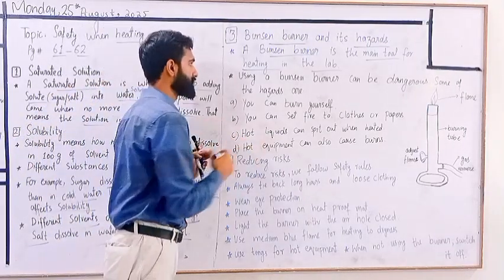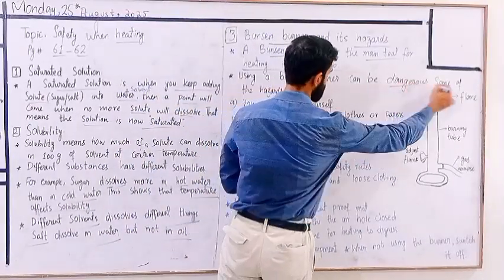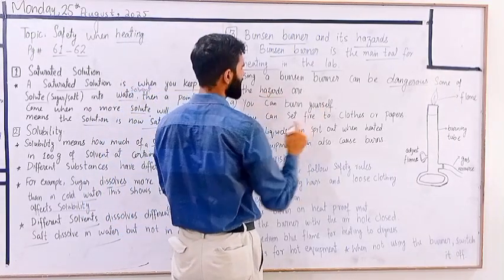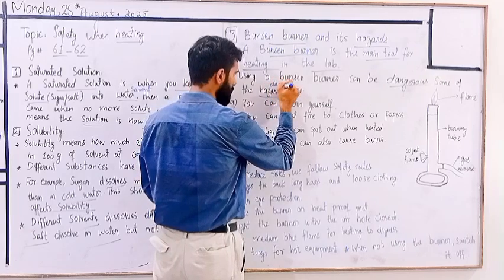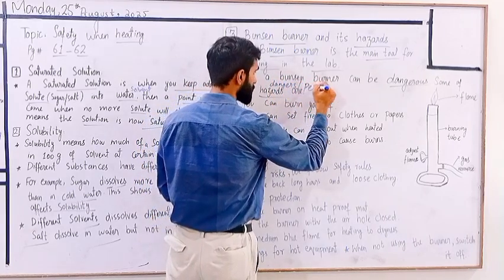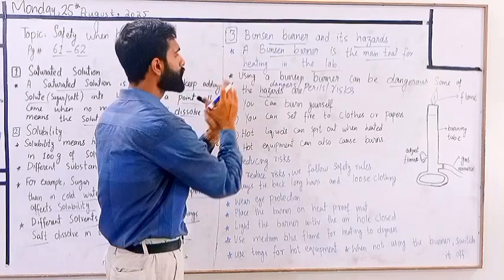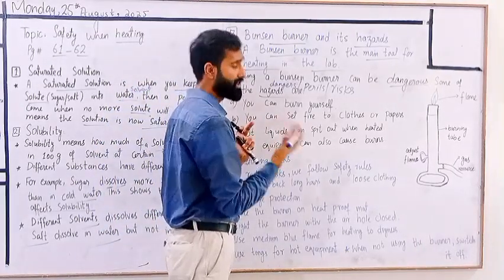Okay? Using a Bunsen burner can be dangerous. So some of the hazards are... What are hazards? Hazards means dangers, perils. Hazards mean risks that are related to the Bunsen burner. So using a Bunsen burner can be dangerous sometimes.